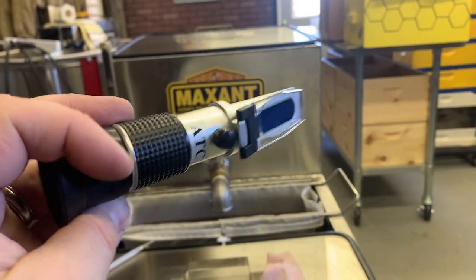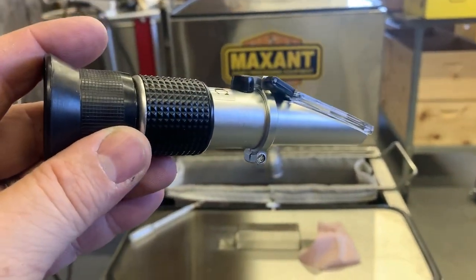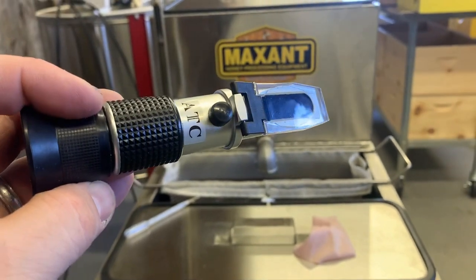So there we go. That's a refractometer and we've tested our honey to make sure that it is the proper moisture content.